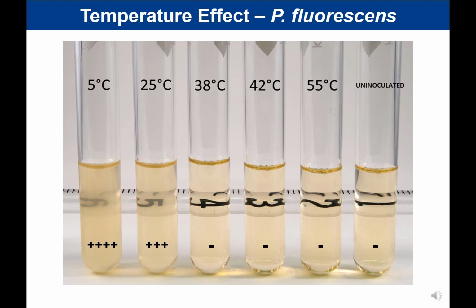And so I want you to start thinking about, based on those growths, based on the fact that it grew at refrigeration and it grew at room temperature, what is the term for this organism's temperature growth. And we'll go over that and we'll put that in a table at the end.